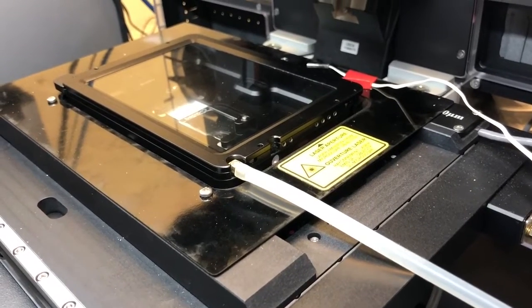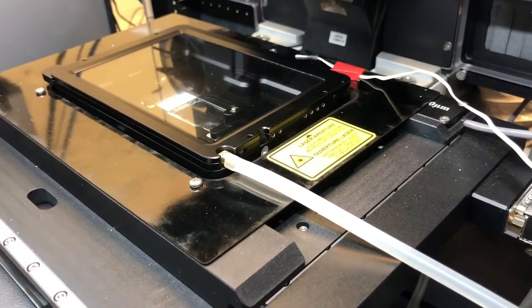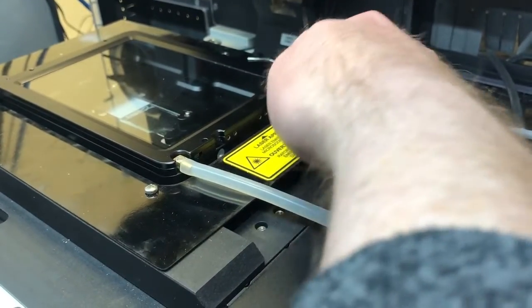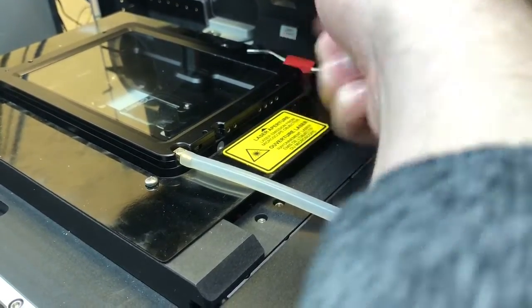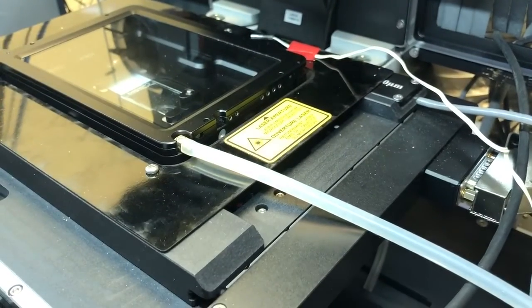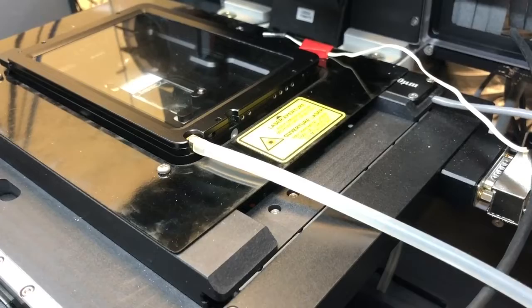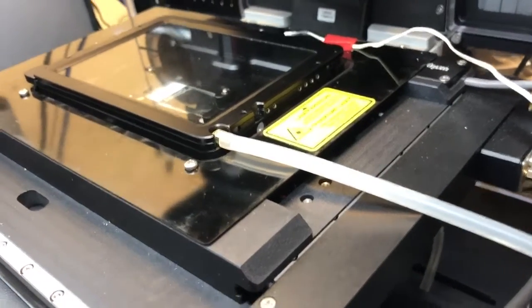An option available to you is, instead of measuring the temperature of the whole enclosure via the thermometer that you can see here, you can measure the temperature inside the sample holder much closer to your sample. Let me show you how to do that.